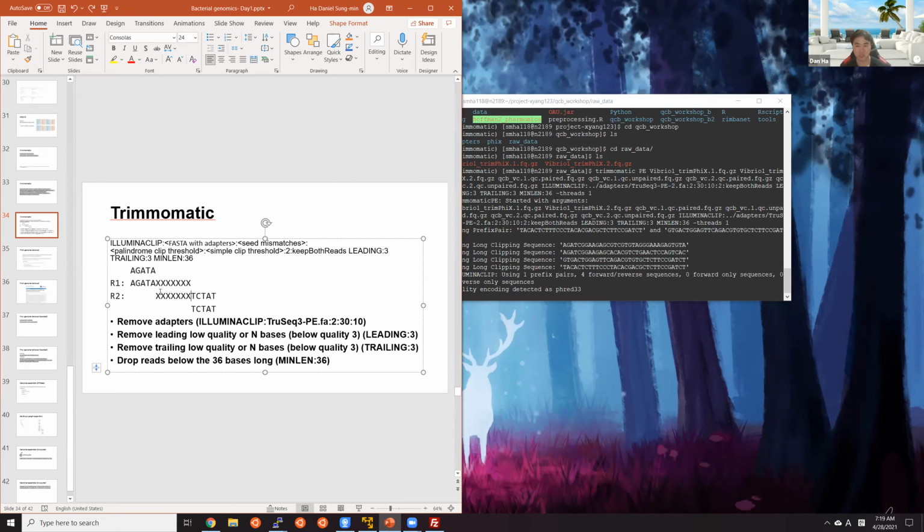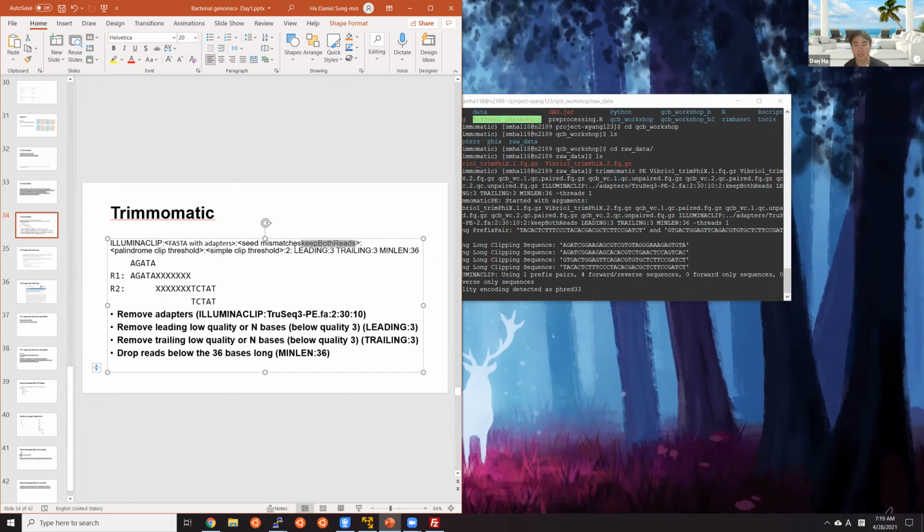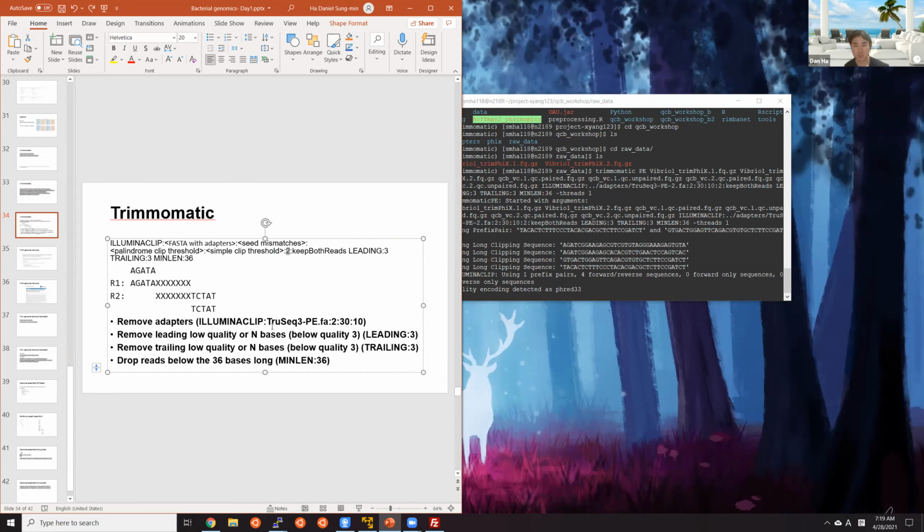If those two are redundant, Trimmomatic by default is gonna remove the reverse read data just to save some space because this is redundant data. But for the further genome assembly pipeline, we do need both of this information, so we want to keep it, right? And then the 2 here is the number of bases of adapter that you're allowed to keep.